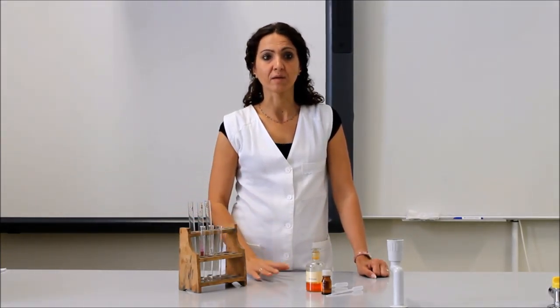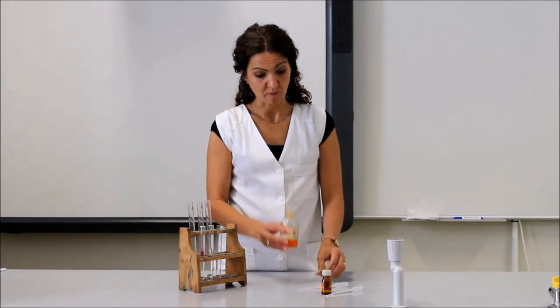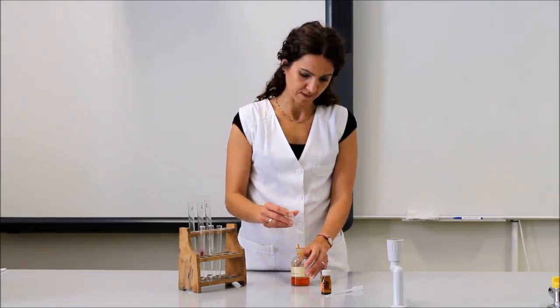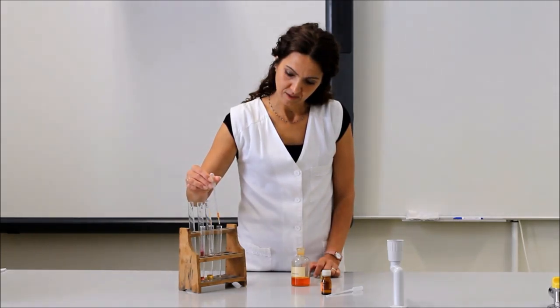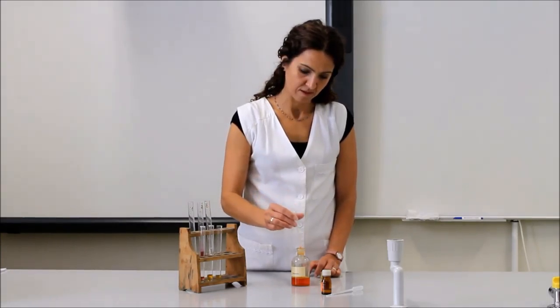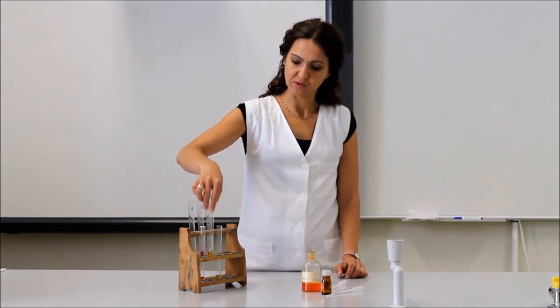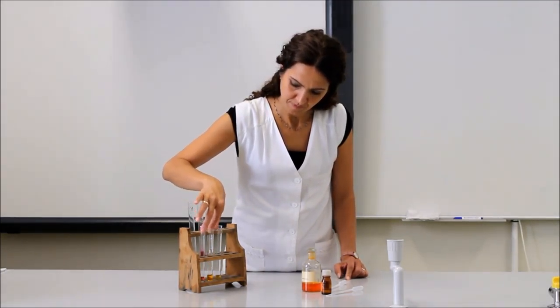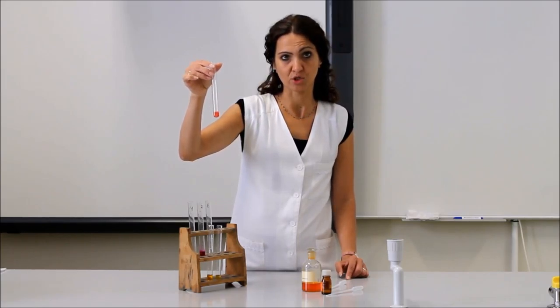Erre lesz szükségünk a második indikátorra, a metil-narancsra, amelynek átcsapási tartománya a savas pH-tartományban van. Ez azt jelenti, hogy a savas és a semleges kémhatást egymástól meg tudjuk különböztetni. Az első kémcsőben a metil-narancs piros színt mutat, ebben van a savas kémhatású oldat. A második kémcsőben a metil-narancs sárga szín, amely jelzi a semleges kémhatást.